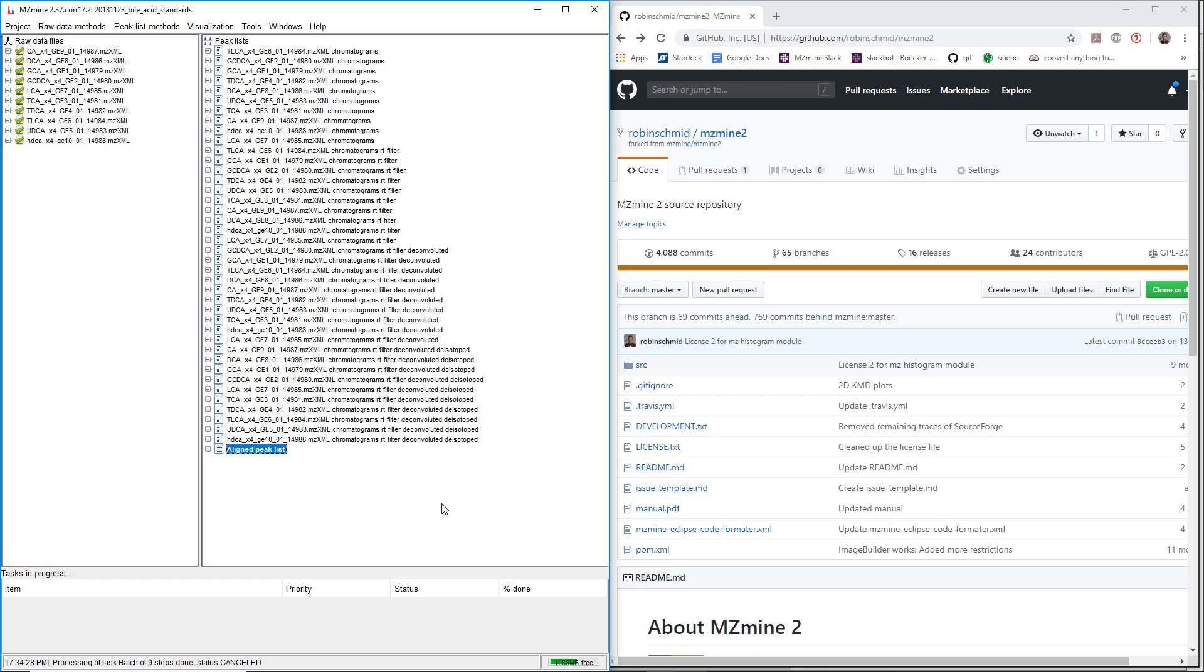This is a short video where you can download mzmine2 with Ion Identity Networking. It is a fork of mzmine2, which is located in my GitHub account.